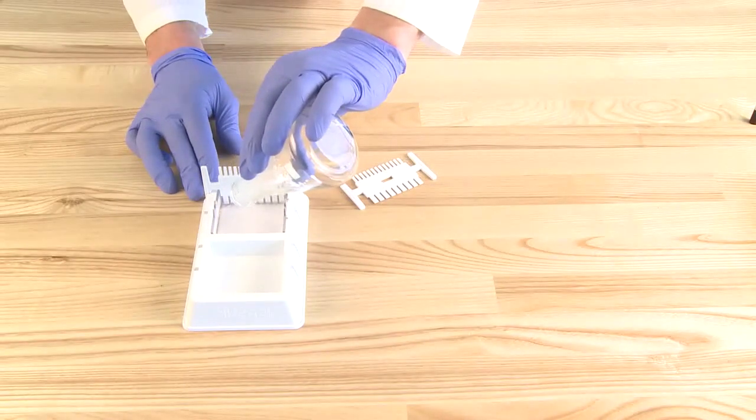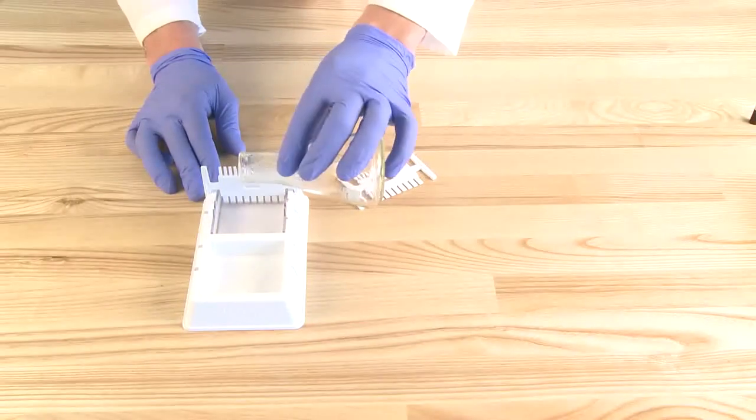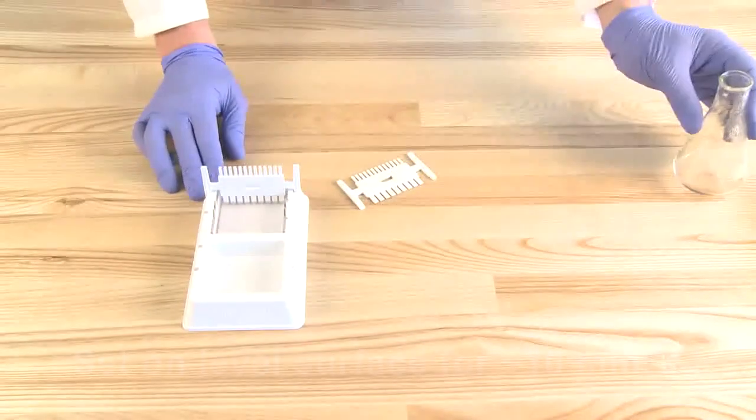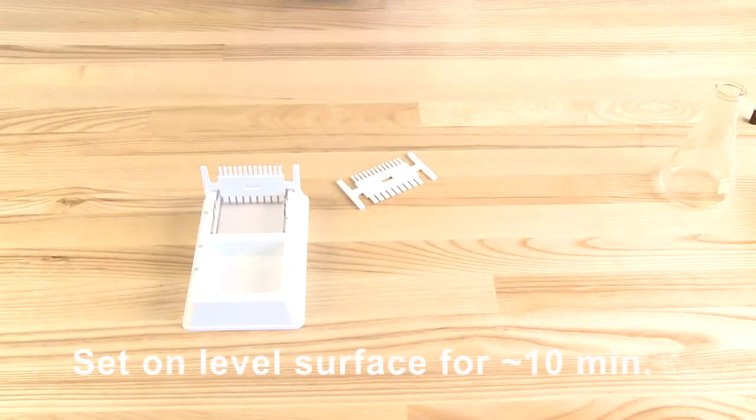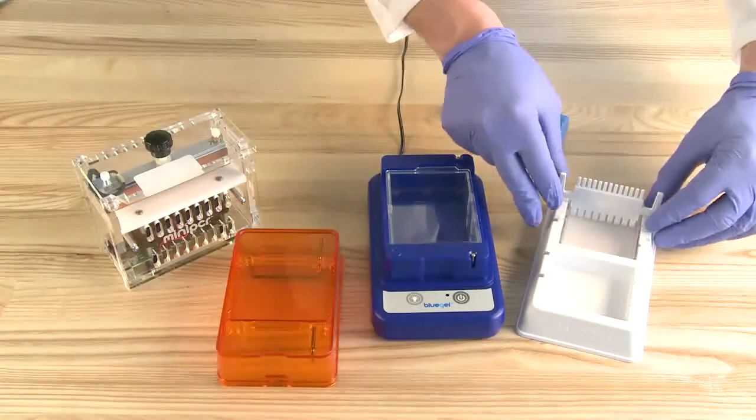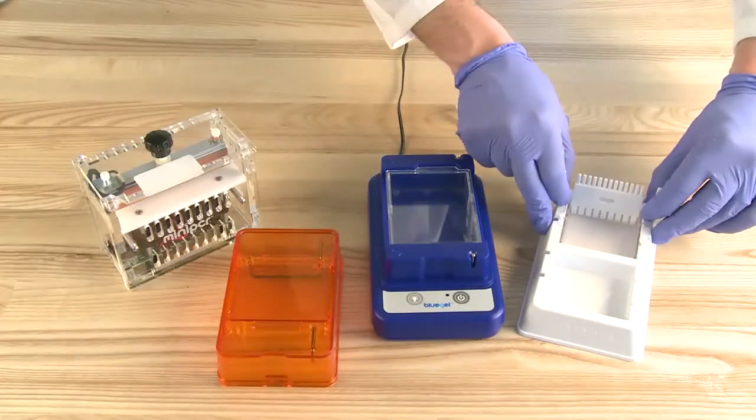If desired, you could also add a second comb midway through the gel. Let the gel set on a level surface until completely solidified. Then carefully remove the comb by gently pulling upwards.